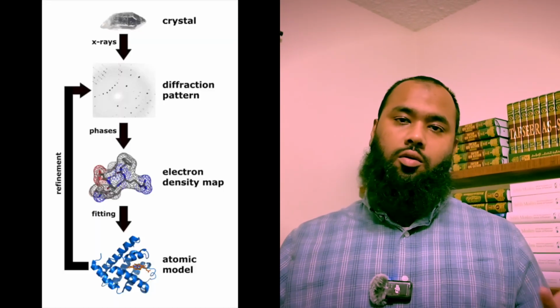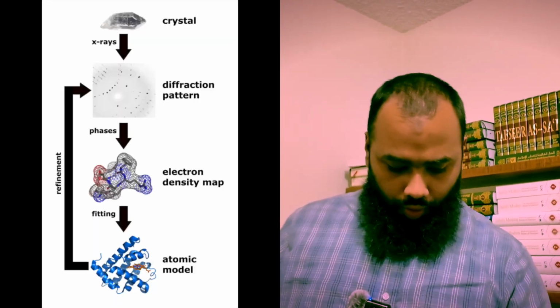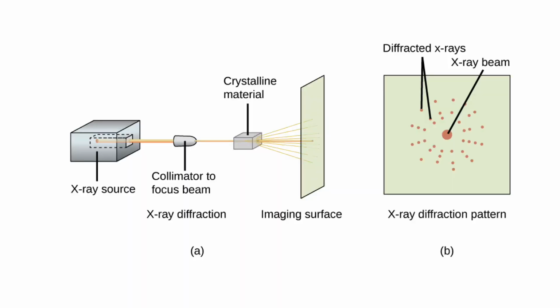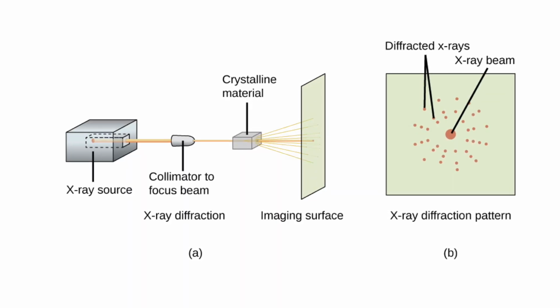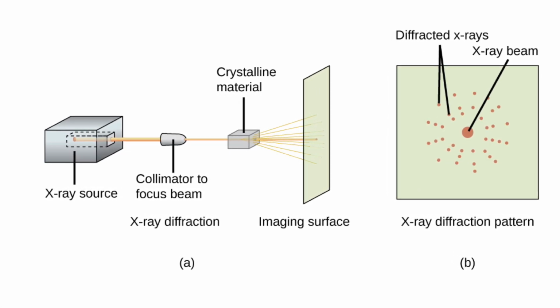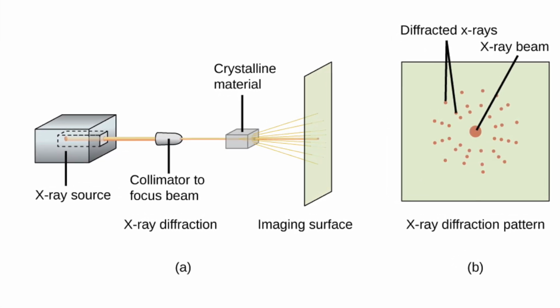So today I'm going to talk about the famous XRD phasing problem, or the phase problem of the X-ray diffraction technique. First, I just want to introduce the technique, XRD, to you. If you're a material scientist, you already know it's XRD, X-ray diffraction, that uses X-rays to shine on any solid material to understand the crystallinity of the material. So it is the basic building block of crystallography.